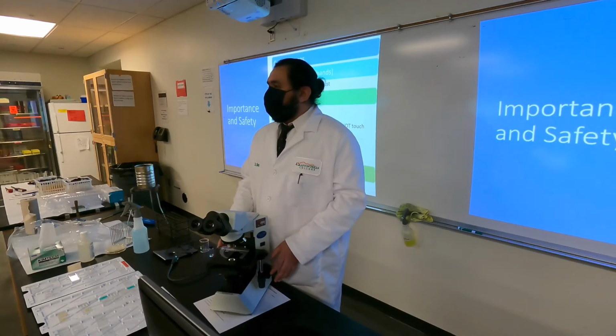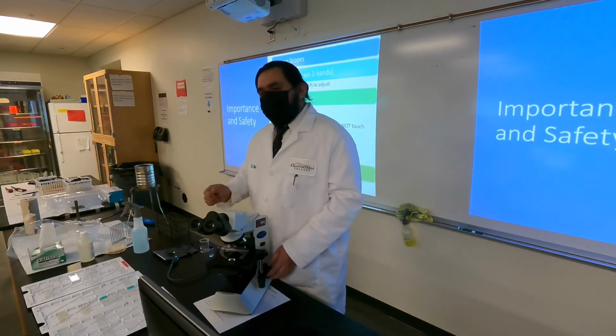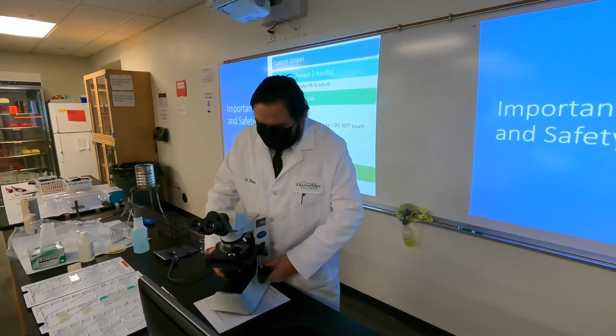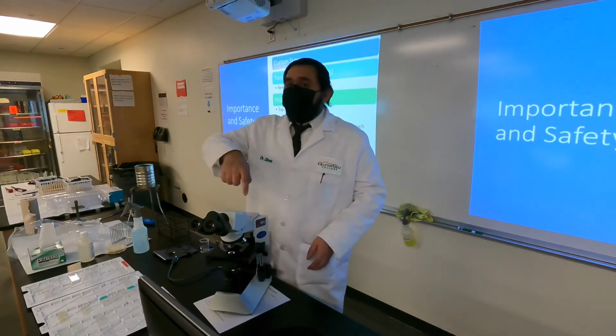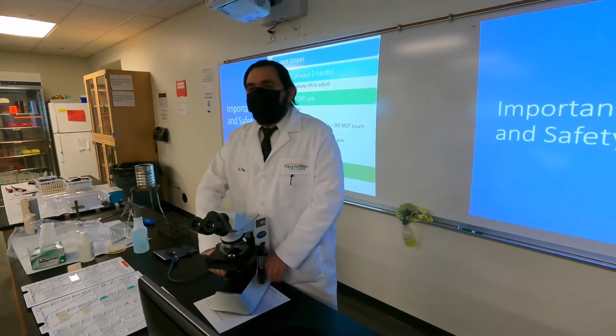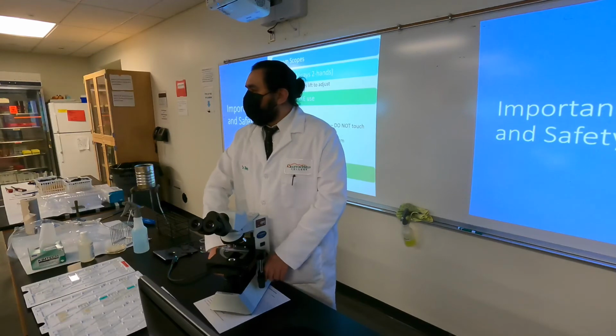Now, here's the thing: if it's not, again, write it down. But if it's anything higher, and you rotate any of these, you break them. This is why it should always be defaulted down to the bottom, okay?